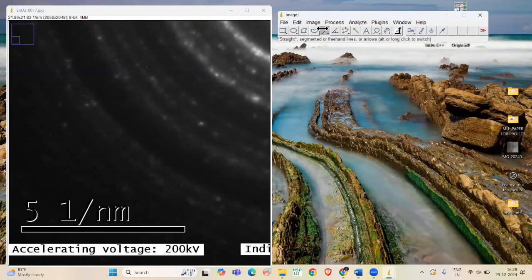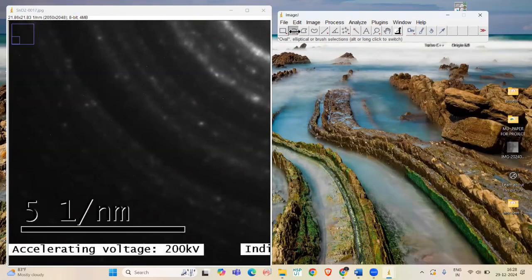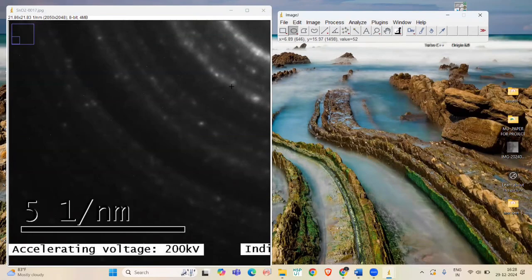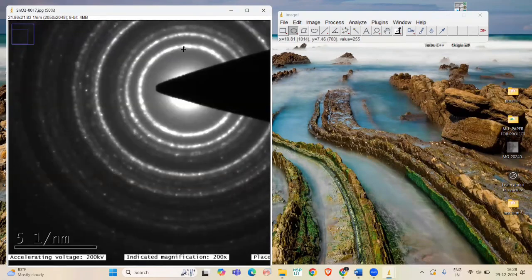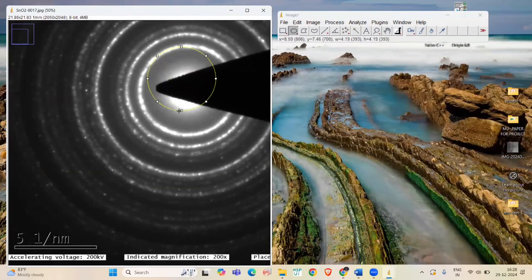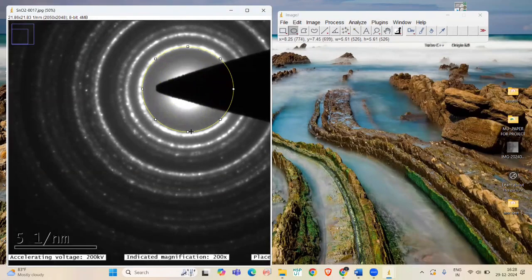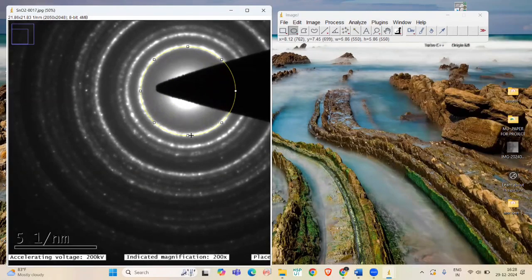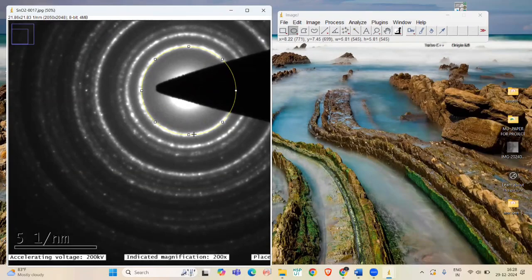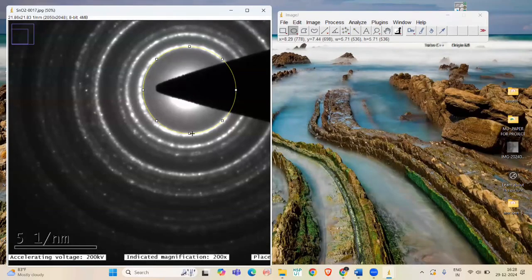Now, select the Oval tool to select a diffraction ring. Here, I am pressing Shift key along with it to get a perfect circle.